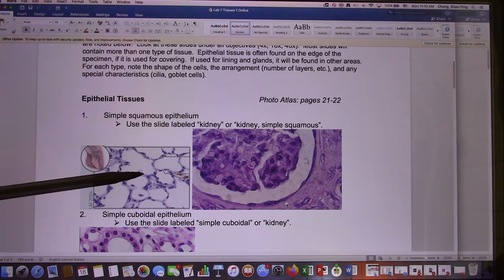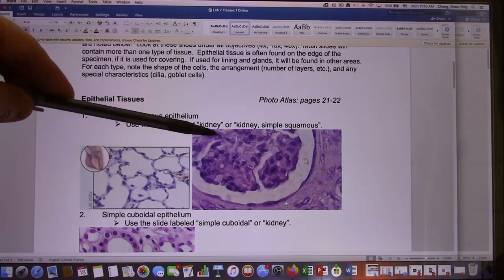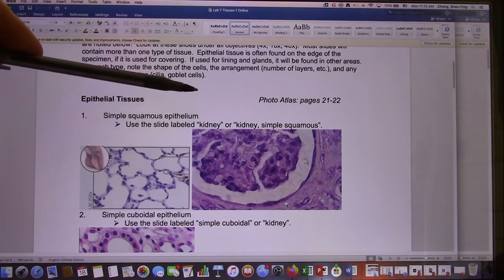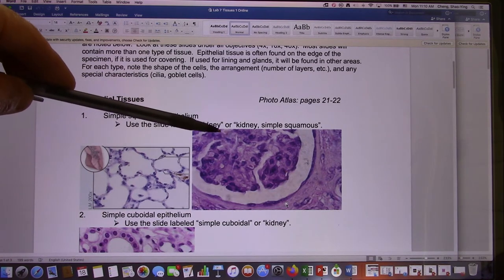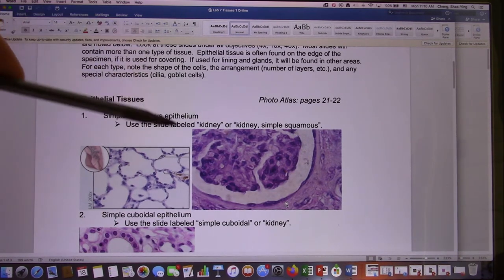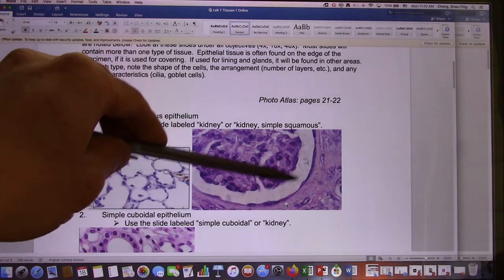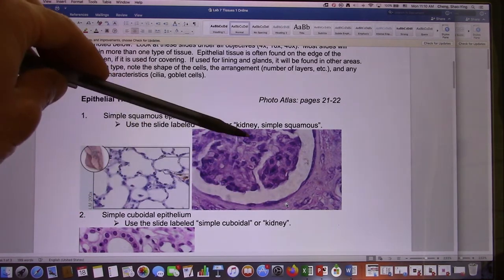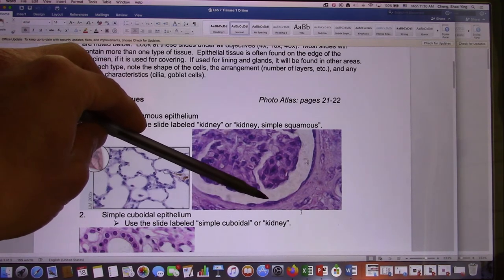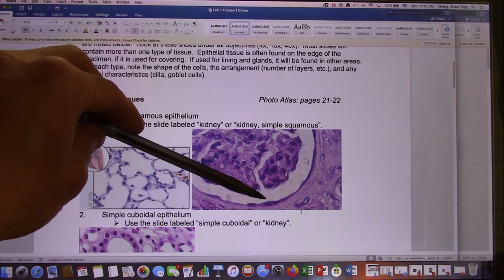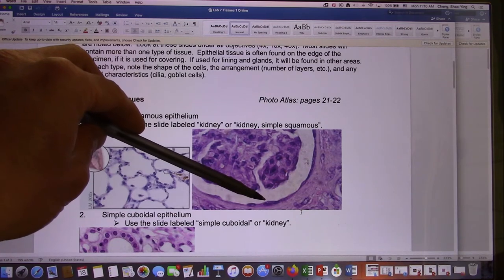Simple squamous is one layer and it's flat. The second example is in your kidney. The kidney has a lot of nephrons — these are the filter tubes in the kidney. The head part has the glomerulus. During the test I will point at this and ask you what kind of epithelium tissue it is. The answer will be simple squamous — two words: simple squamous.